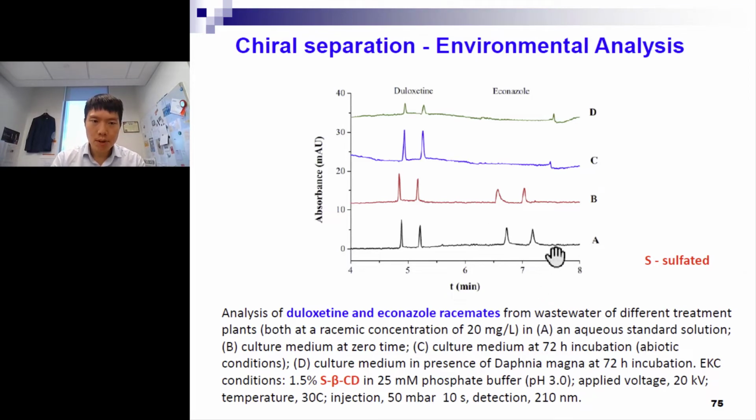And if you do the same reaction, but in the presence of this Daphnia magna, those little worms there in the water, then it also changes the amount of the duloxetine. So it's very interesting. Again, I want to highlight here this S stands for sulfated beta cyclodextrin.